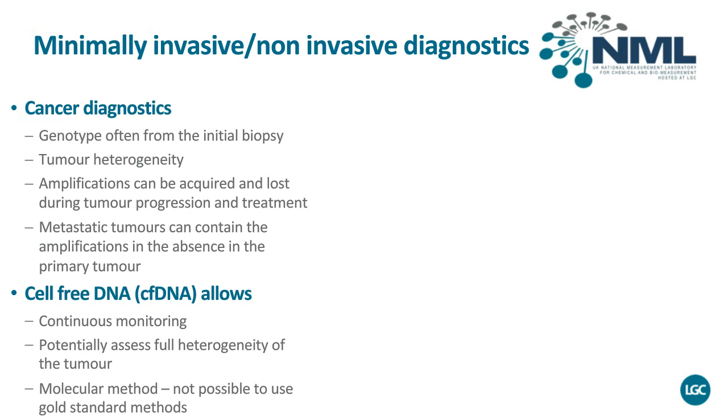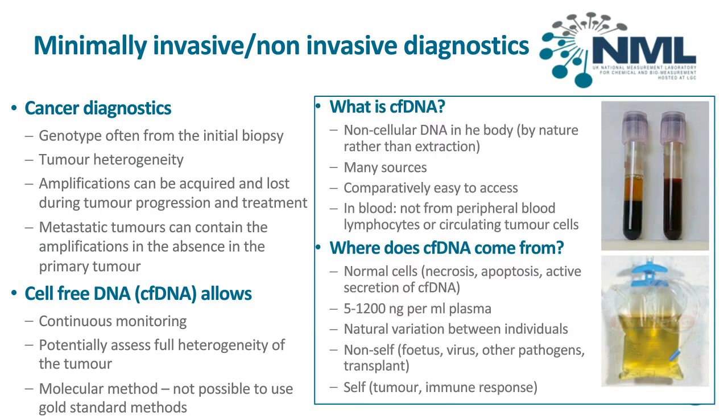So the DNA is just found in the circulating system, and it's not in cells. So something like FISH or immunohistochemistry would not be able to look at how many HER2 copies you have. Now, very briefly, what is cell-free DNA? Well, it's the non-cellular DNA in the body fluids. It's non-cellular by nature rather than the extraction.